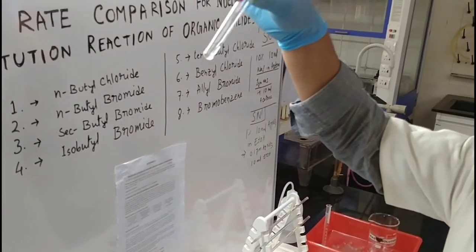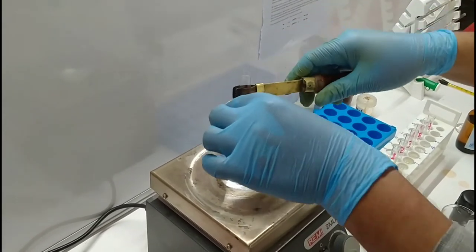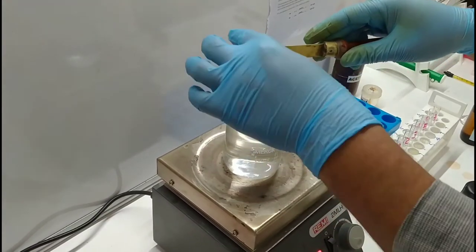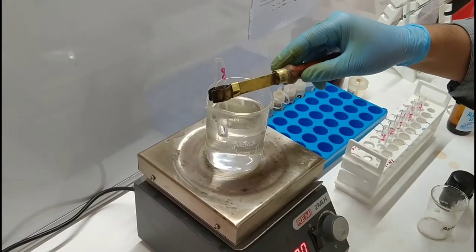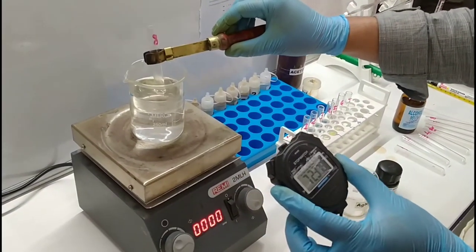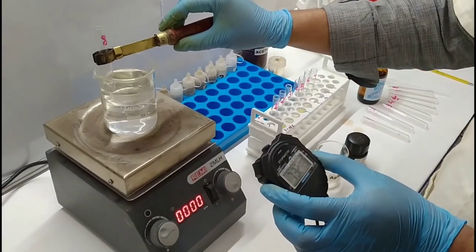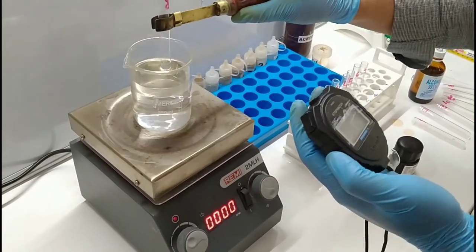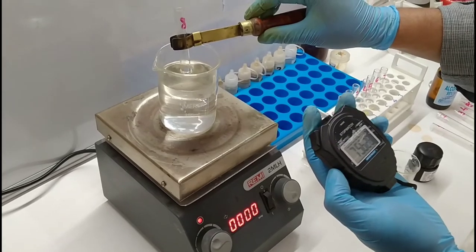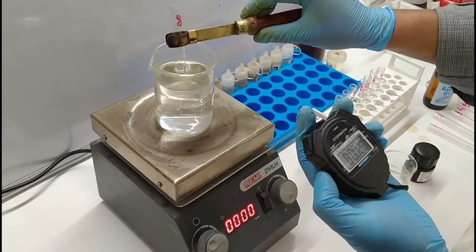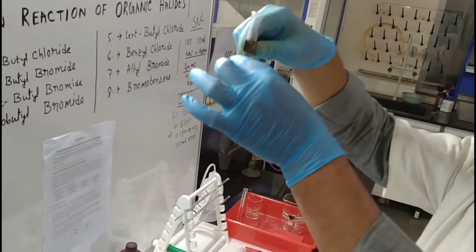Still nothing is appearing inside the 8th test tube, so we have to put it in the hot water bath. At 7 minutes 20 seconds, still no changes inside the test tube. 8 minutes completed and no changes inside the test tube — that means we consider this one as no precipitation. The SN2 bromobenzene test is complete.